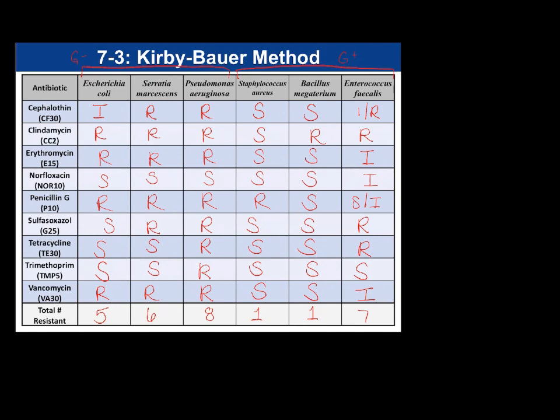This is an unmutated strain of Staph in the lab, so we do have some strains of Staph out in the environment that are resistant to a number of different drugs, such as MRSA. Enterococcus faecalis is microflora, but we do see some resistance genes in Enterococcus faecalis, and it can be an issue in the hospitals to have an overgrowth of Enterococcus faecalis and then have it be resistant.